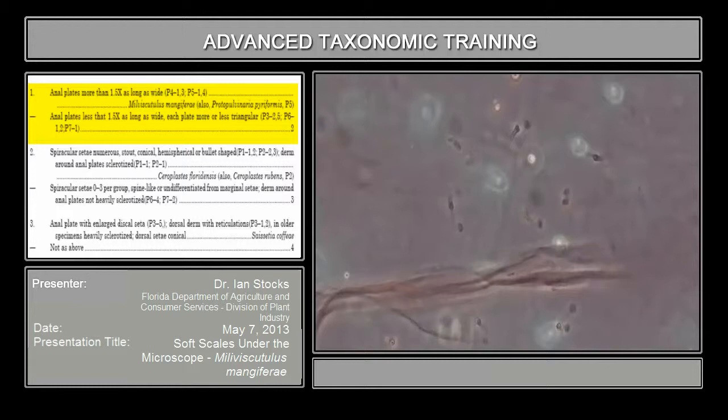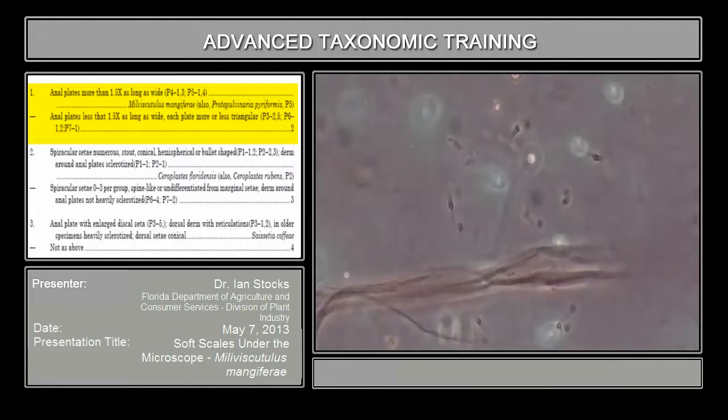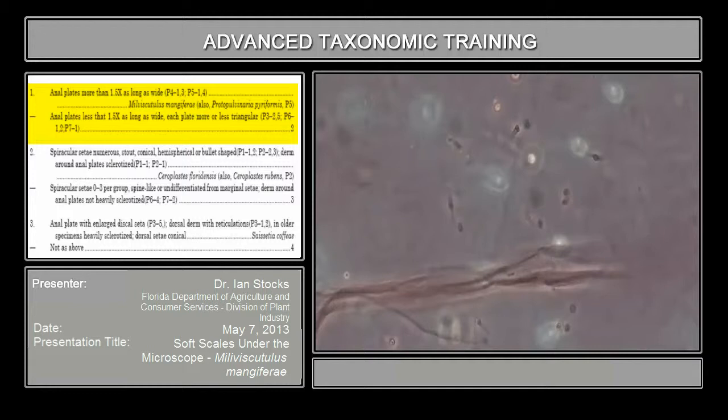There can be more than one morphology in a given specimen. At the species level you can have one, two, three or so distinctly different configurations of that morphology. The distribution of those different configurations can be regionally significant. This is a very important character to be familiar with in soft scales — large chunks of typical keys are dealt with by taking a look at the configuration or distribution of those ducts.